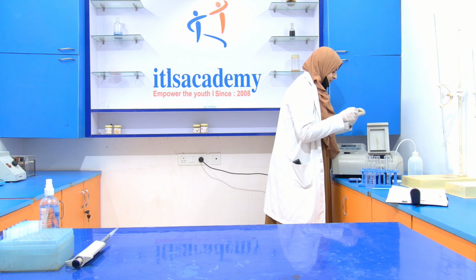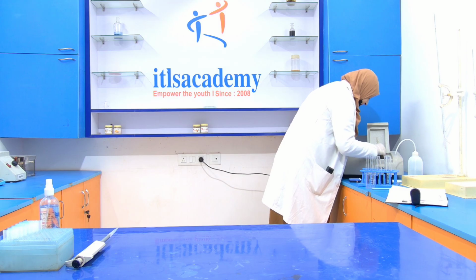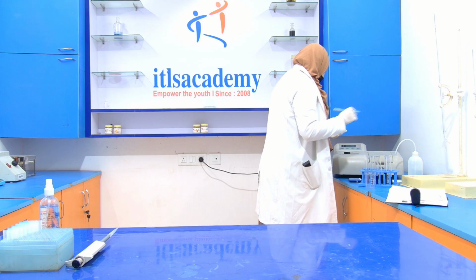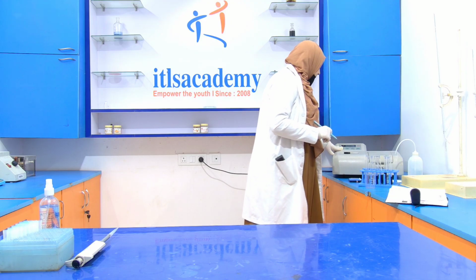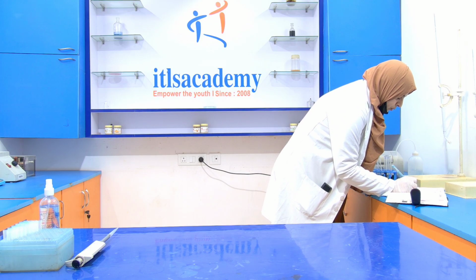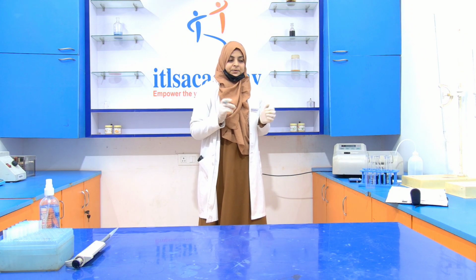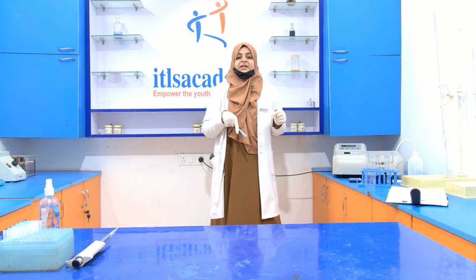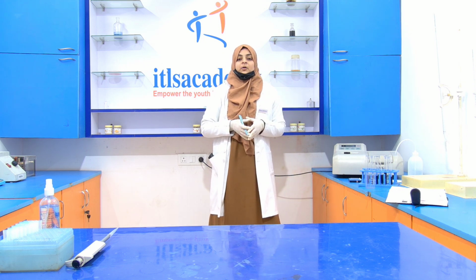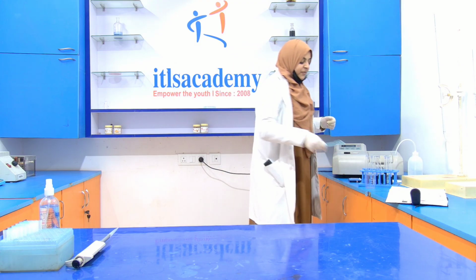Put it in the spectrophotometer like this. Now note down the reading. The reading is around 0.0010. You have to note down the blank reading, because with the help of this reading we have to plot a graph, and then with the help of the formula we will find out the concentration of protein in that particular soft drink.